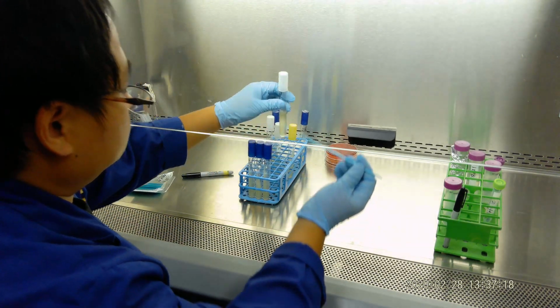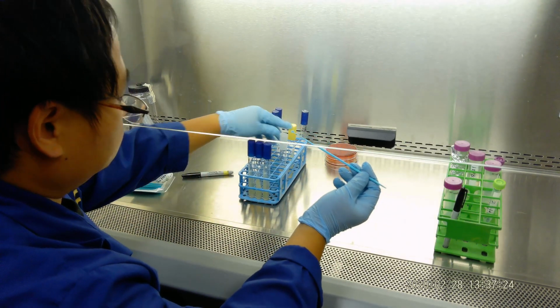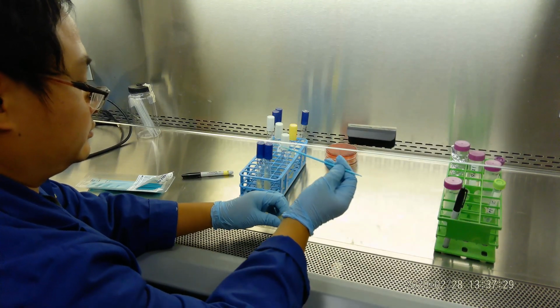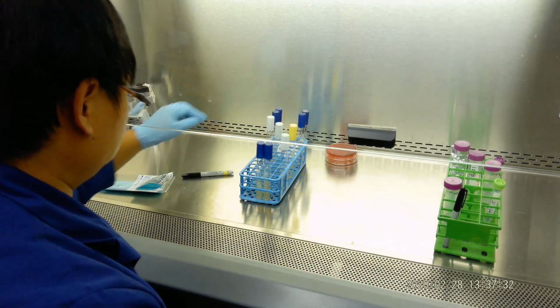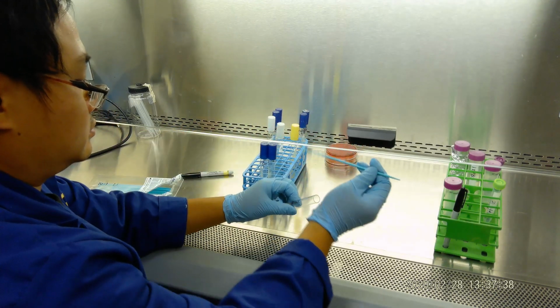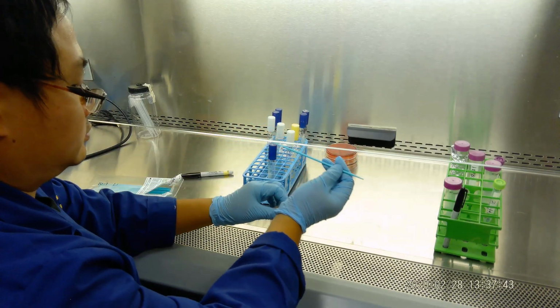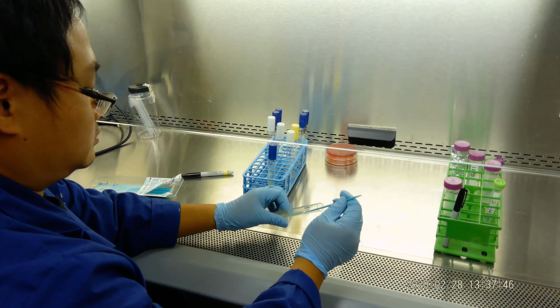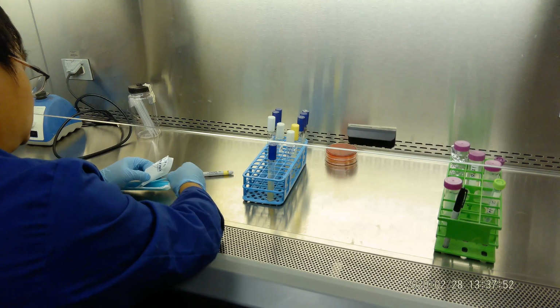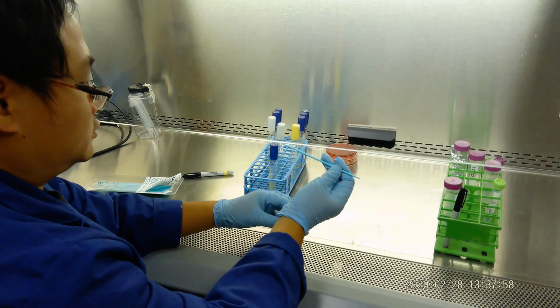Then the second one, we also do a streak plating on the slant. So that's 25. And it's 37. Last one.